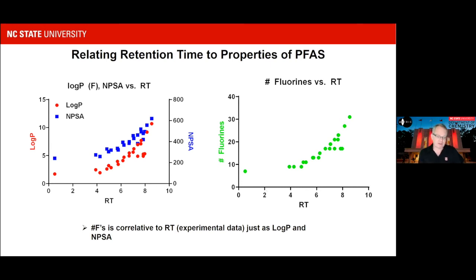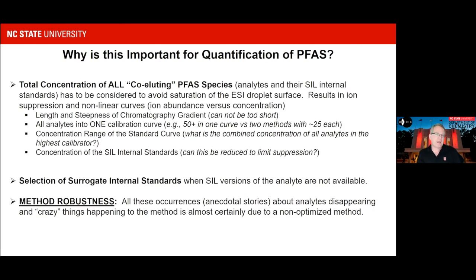So we've now switched to just looking at numbers of fluorines in a molecule, and that's important when you're thinking about surrogate internal standards. You'll want to match your numbers of fluorines because it's going to change your ionization efficiency for each individual compound. And when you're running thousands and thousands of environmental samples or human exposure samples, which we are doing, you have to have a relatively rapid method. Co-eluting isn't really, they're not right on top of each other, but there's a lot of compounds coming out in a 10-minute retention time window.